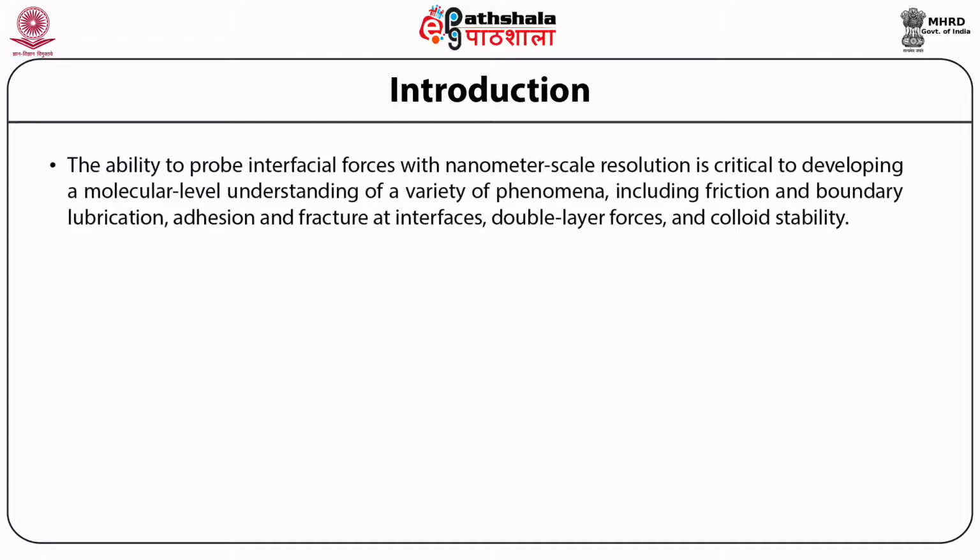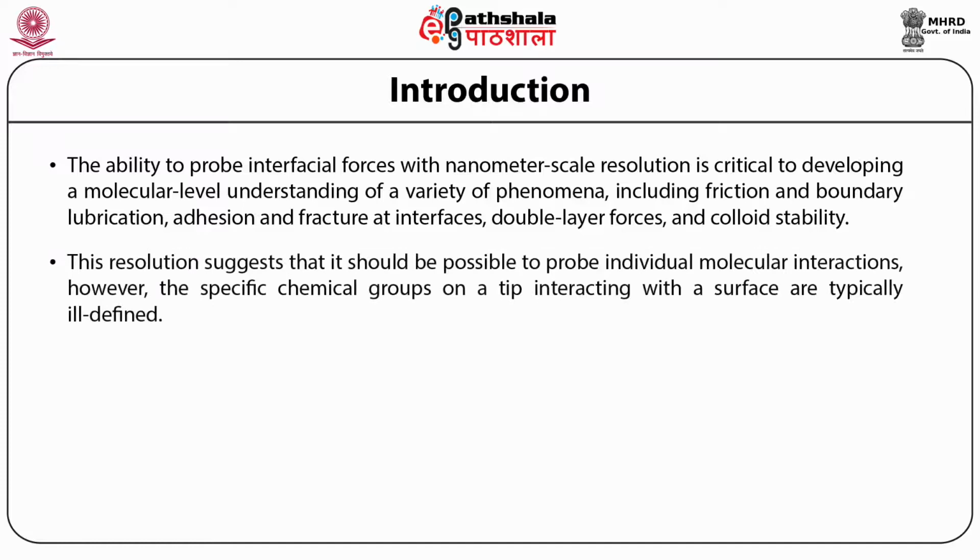The ability to probe interfacial forces with nanometer scale resolution is critical to developing a molecular level understanding of a variety of phenomena, including friction and boundary lubrication, adhesion, and fracture at interfaces, double layer forces, and colloid stability. Significantly, the absolute force resolution in AFM can be several orders of magnitude better than the weakest chemical bond. The resolution suggests that it should be possible to probe individual molecular interactions.